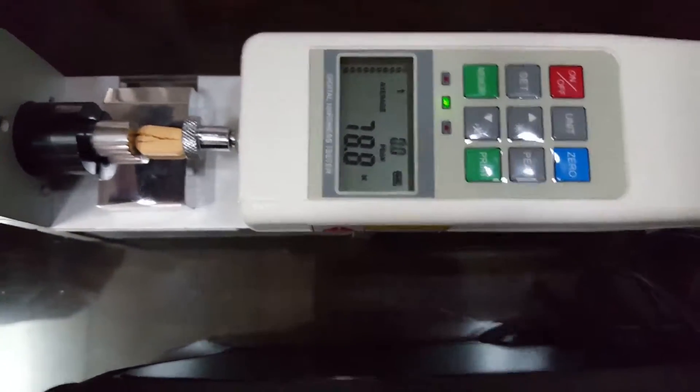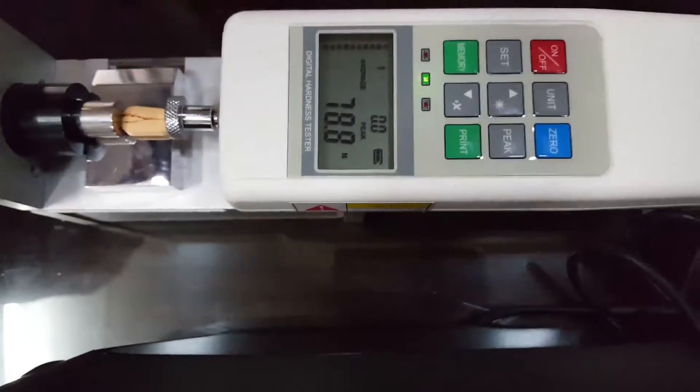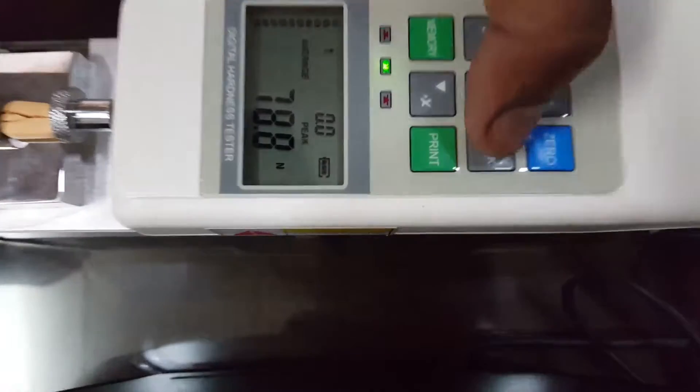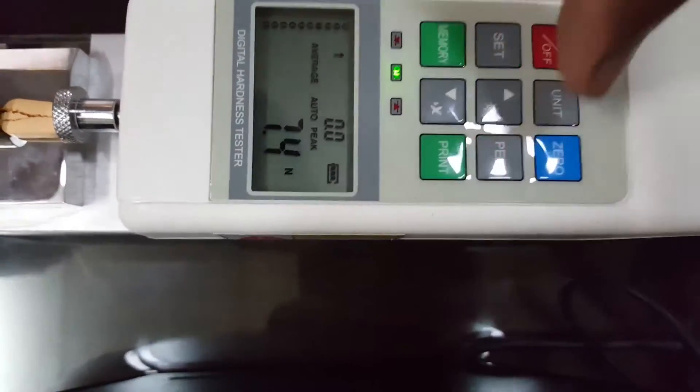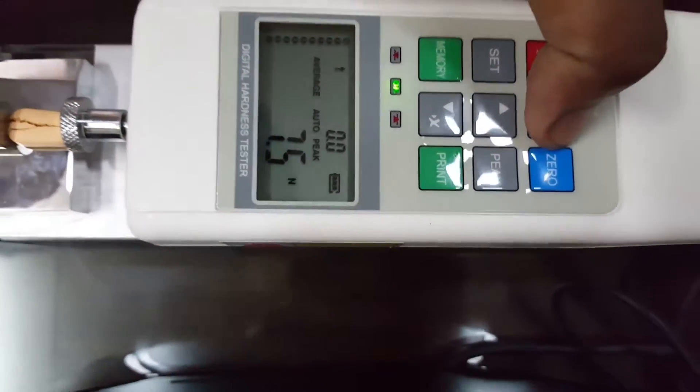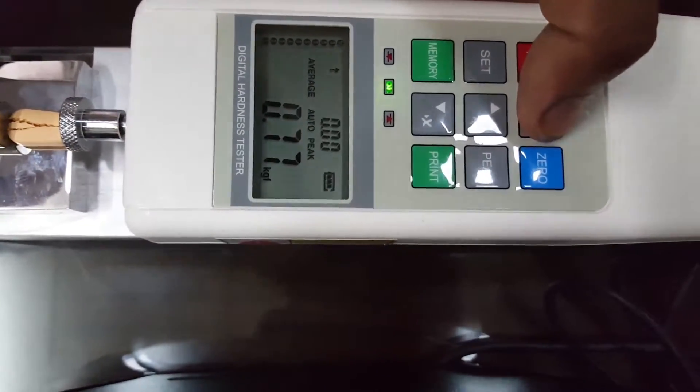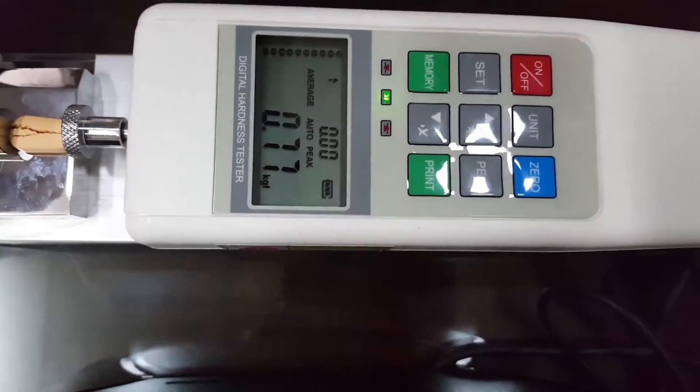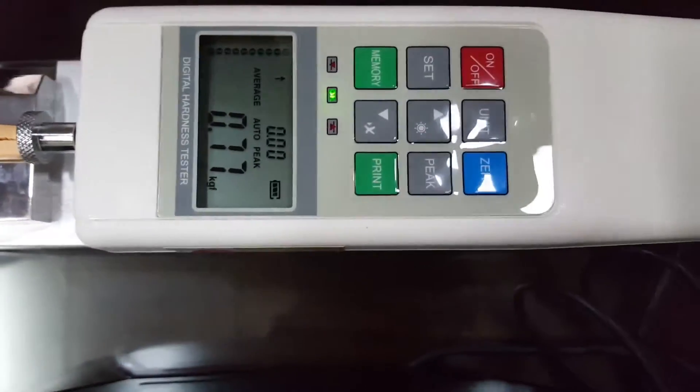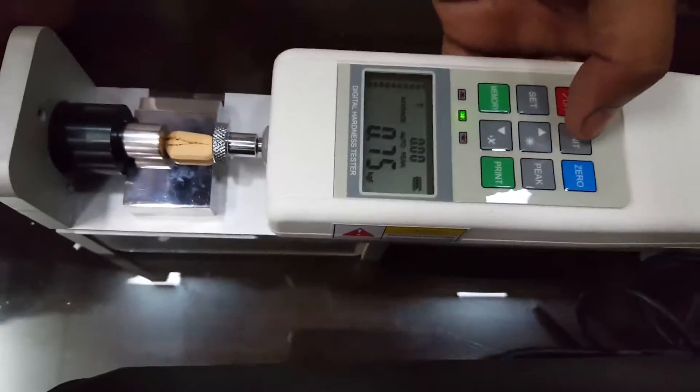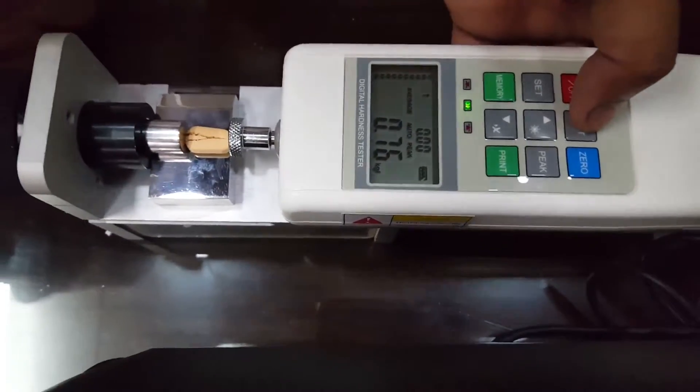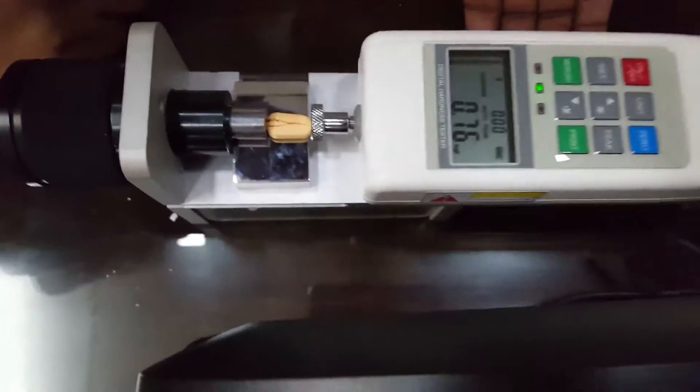If we convert it into kg, it shows 7.77 kg force. This way we can break all 10 tablets.